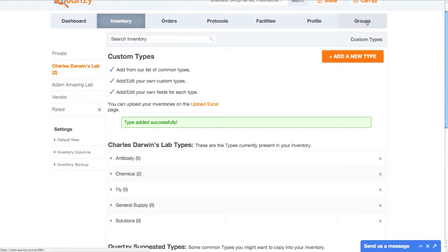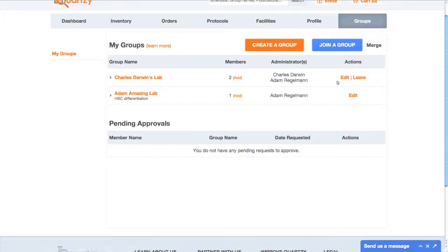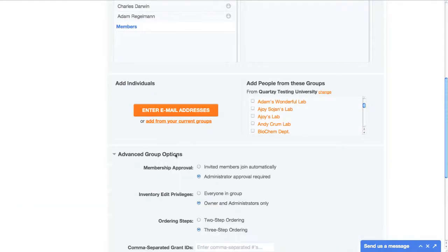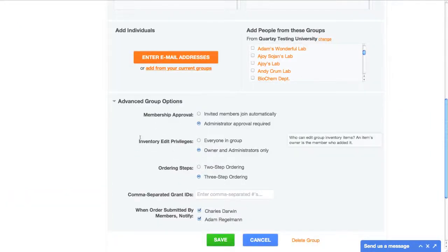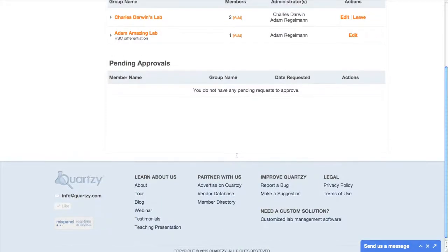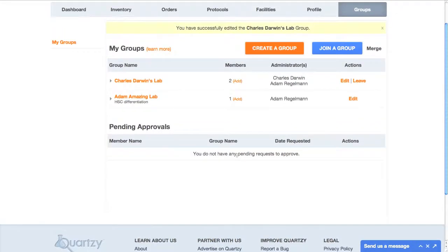As a group admin, you can set the editing privileges within a group's inventory. Since this is a group setting, you'll have to go to the groups area. Now click the edit link and then advance group options. By default, editing privileges are set so only the person who adds an item, or a group administrator, can edit it. But if everybody in your lab gets along famously, you can simply click everyone in group and then everybody can pitch in. When you're done, just click the create or save button at the bottom and your settings will be in the system.